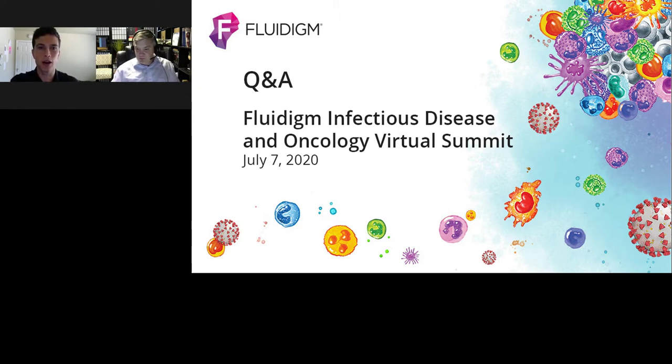Great. And are more algorithms for high-dimensional data reduction planned? Yeah, absolutely. And I know Dave alluded to that many more of these things are coming down the line. Just in the next few months, probably by the end of the summer, we're going to have a brand new pipelines tool in FCS Express that's going to allow you to not just work with tSNE and SPADE, it's going to allow you to work with tools like UMAP and SOM, some other familiar ones that are on the market.